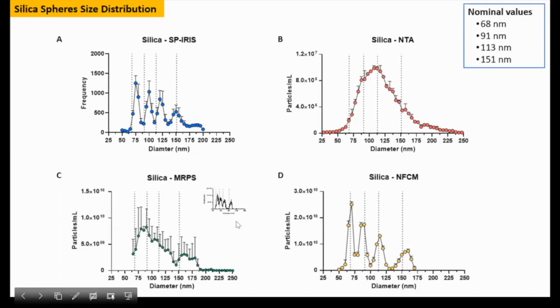However, this distinction was somewhat masked when averaging the 3 replicates, ending us with a little bit of a wonky-looking graph here. We speculate that this may have been due to aggregation of silica spheres when using PBS as a buffer.